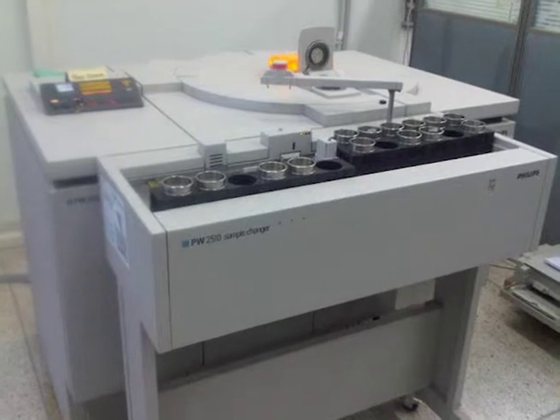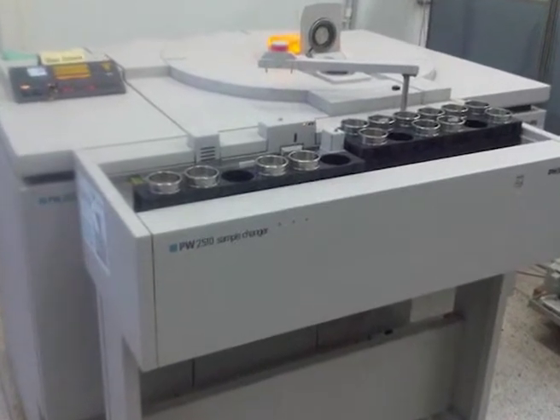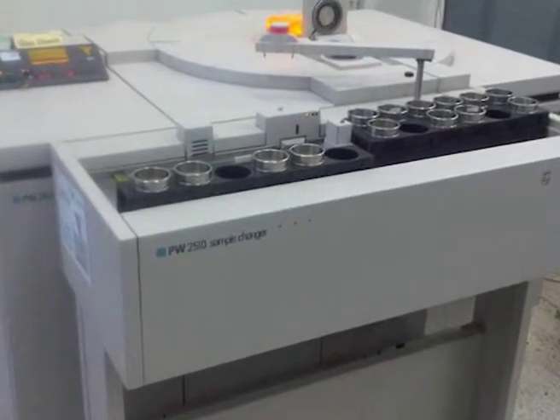These are both non-destructive techniques. Because of the penetration depth of the primary X-rays, the X-ray fluorescence analysis yields elemental data from several layers of multi-layered paint fragments simultaneously. This analysis can be used qualitatively as variations in layer thicknesses cause variations in X-ray ratios of elements present.